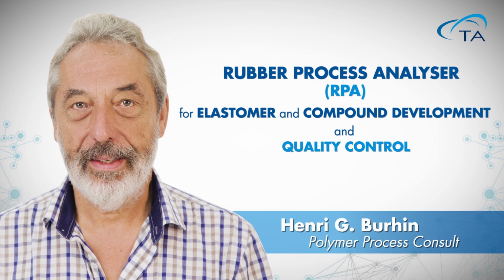Okay. Coming back to another question on the differences between an RPA and an open boundary rheometer like an ARES. In the beginning, there was a diagram comparing the RPA and an ARES. Is there an influence of the film that's used in the RPA? Based on our experience, we haven't seen any influence of the film on the measurement. But of course, especially for compounds, we cannot really test all possible compounds, because I believe in the world there is an infinite number of compounds. So based on our experience, we haven't seen any influence. But to be sure, both tests have to be run.